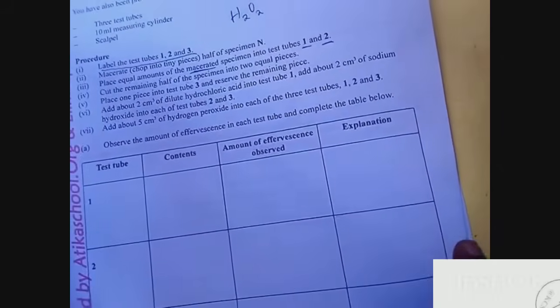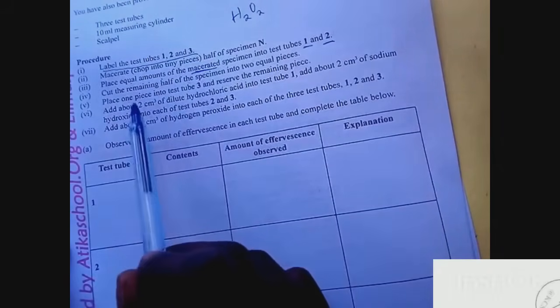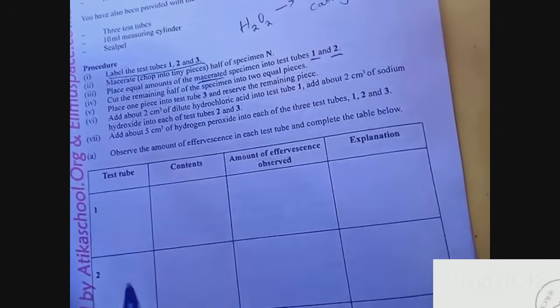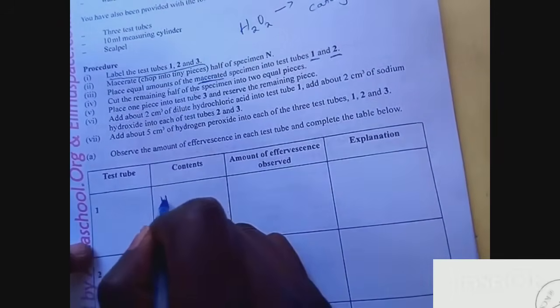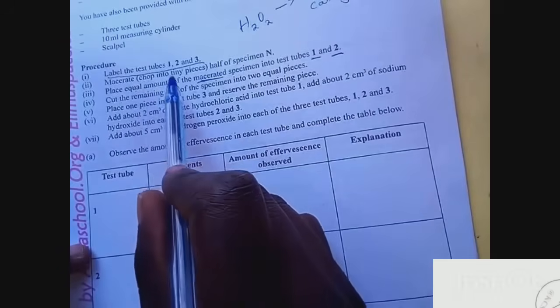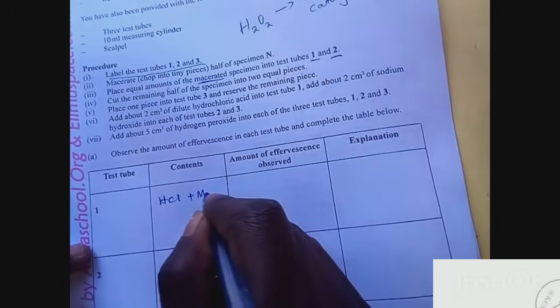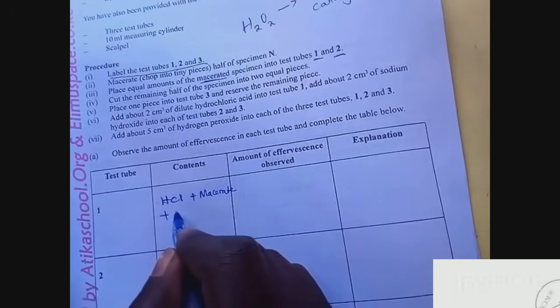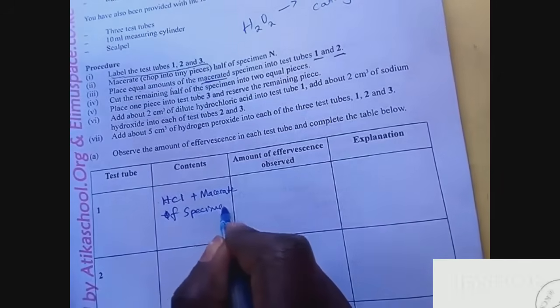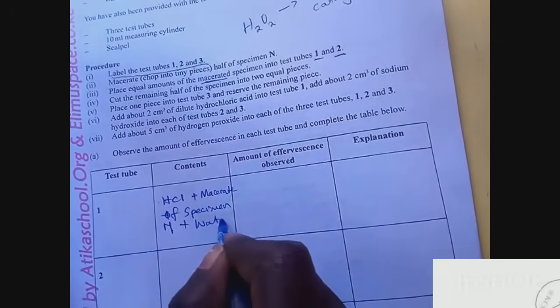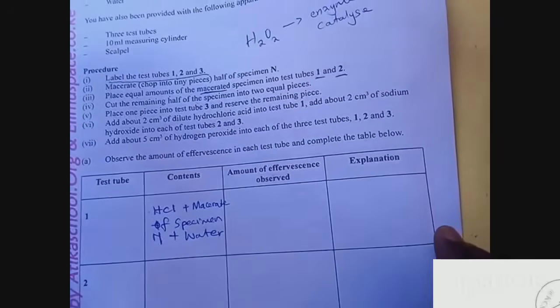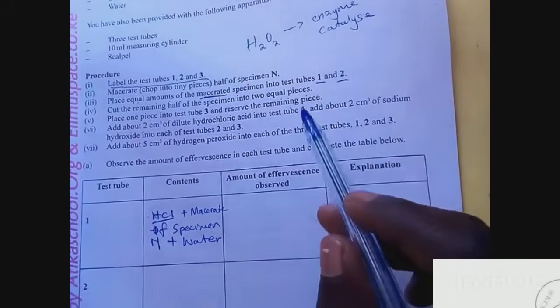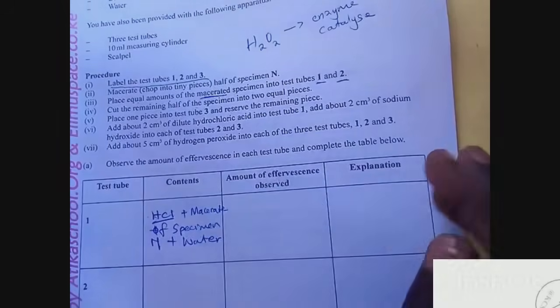Let's see the contents in test tube one. You have been told to add about 2 cm³ of dilute HCl. So the content in test tube one is HCl plus the macerated specimen N plus hydrogen peroxide. What is your observation? First of all, when you see HCl being added and you know you are testing for enzyme catalyst, the acid denatures the enzyme.